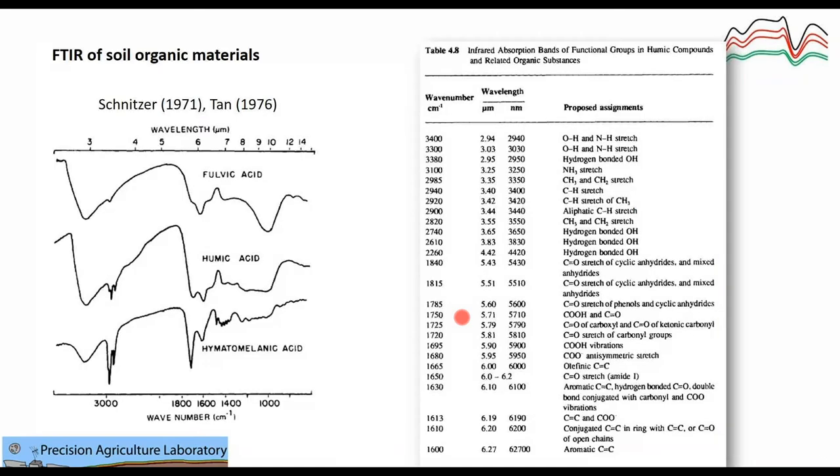So that was NIR spectroscopy, but by the time of NIR spectroscopy, they were also seeing advances in middle infrared spectroscopy. The NIR range goes from 400 nanometers to 2500 nanometers, and after that is the middle infrared part of the spectrum. If you imagine the NIR being somewhere here, we then continue with the middle infrared part of the spectrum. The studies in middle infrared spectroscopy were much more advanced.